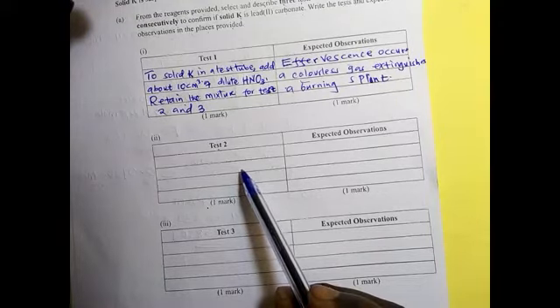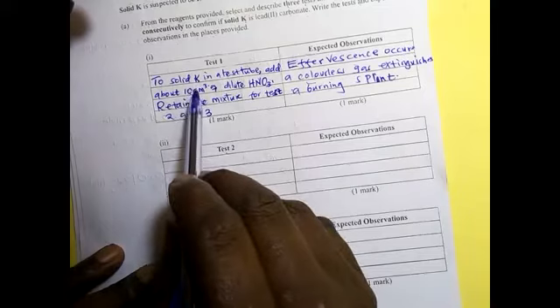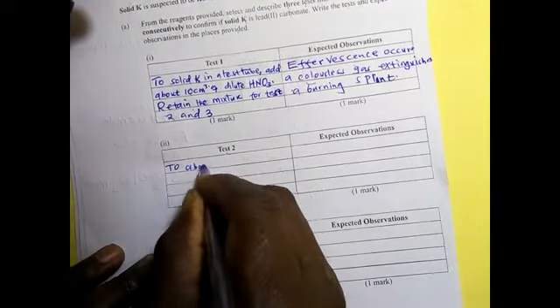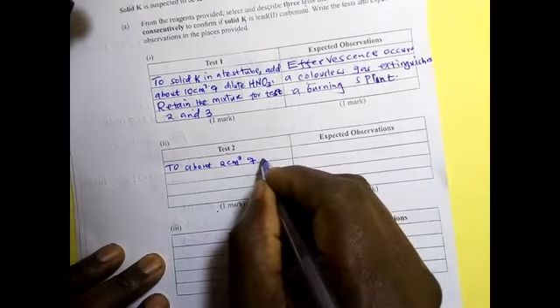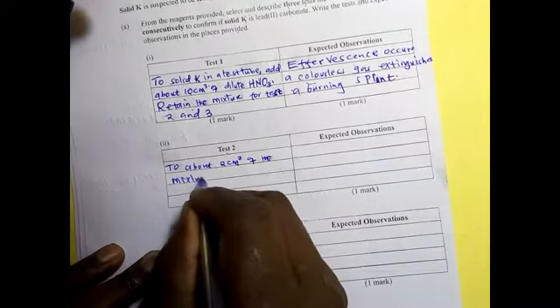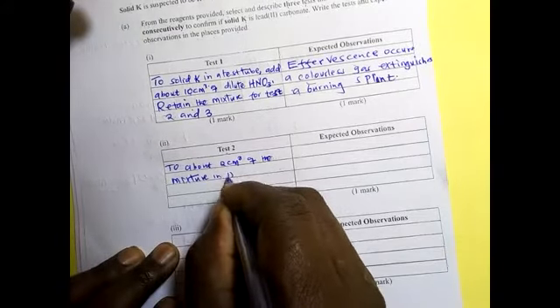Therefore, we now take about 2 cm³ of the mixture in test 1 above.